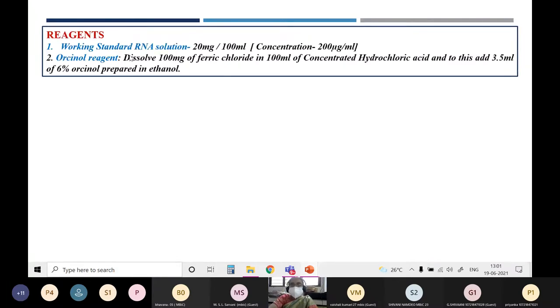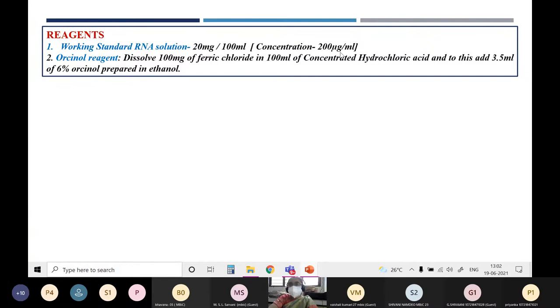The two important reagents required for estimation of RNA: first is the working standard RNA solution at a concentration of 20 milligrams in 100 ml. You weigh 20 milligrams of RNA and first dissolve it in some amount of saline citrate buffer, because RNA is not directly soluble in water. Take it in a standard flask, add a little amount of sodium citrate buffer, dissolve it thoroughly, then make it up to 100 ml with saline citrate buffer so that the concentration becomes 200 micrograms per ml.